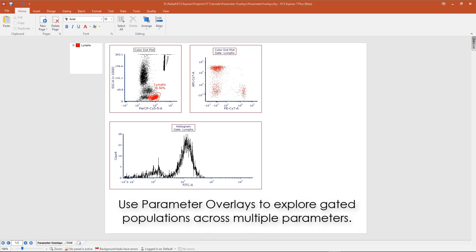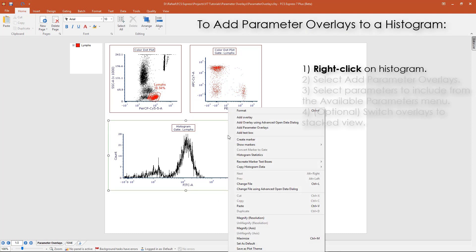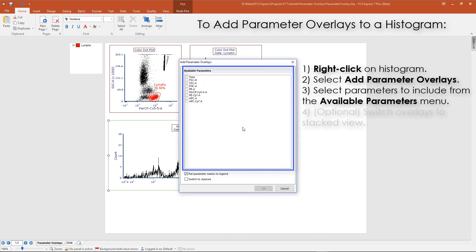Parameter overlays can be used to explore gated populations over multiple channels. To add parameter overlays to a histogram, right-click on the histogram and select Add Parameter Overlays. Select from the available parameters listed in the Add Parameter Overlays window.